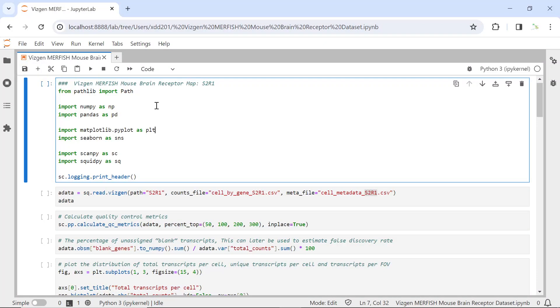Hello everyone. Welcome back to my video tutorial for spatial dataset analysis. In this video, I'm going to show you how to perform spatial data analysis for the MERFISH mouse brain receptor dataset using the SquidPy package. For today's demonstration, I'm going to use the slice one replicate one dataset. You can download this dataset from the MERFISH website.